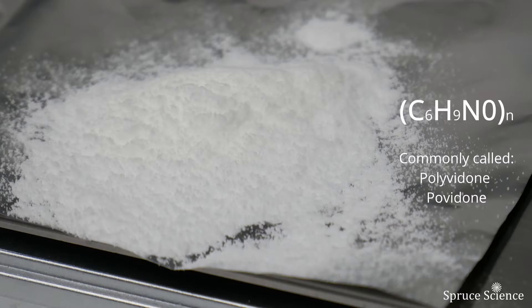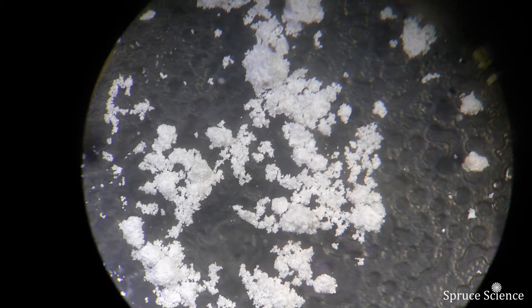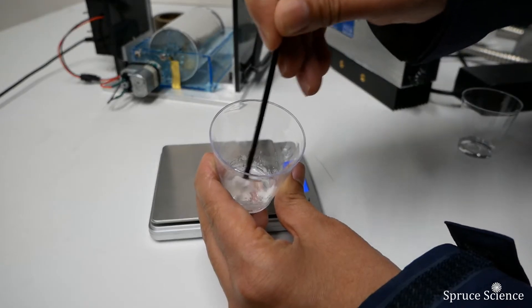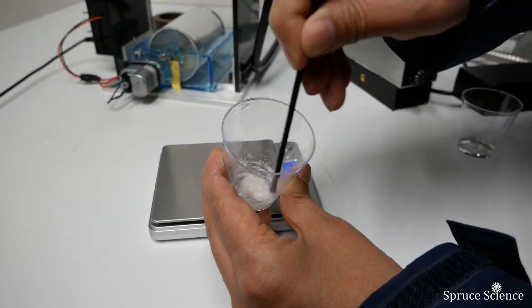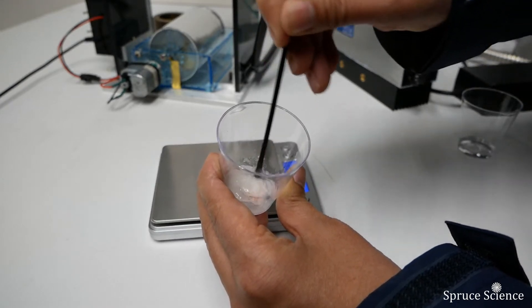PVP is a synthetic polymer that is amorphous and appears white to light yellow. When dry, PVP is a light flaky powder that is odorless and non-toxic. It's soluble in water and other polar solvents such as methanol and ethanol. The substance attracts and holds water from its surroundings and can readily absorb up to 40 percent of water by its weight. PVP solution has good wetting properties and readily forms films, making it a popular electrospinning material because of its low cost and effectiveness.